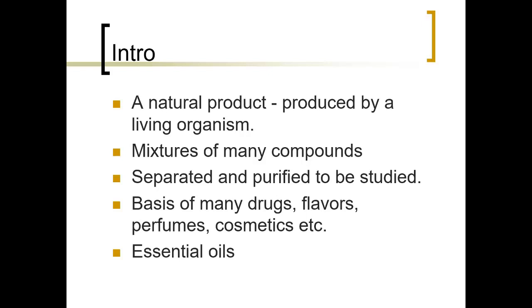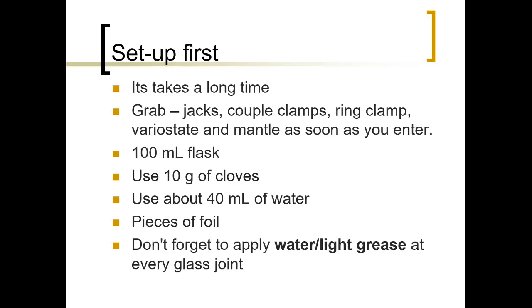In this lab specifically, a little bit different than the extraction of nutmeg, we're going to get an oil, which we call an essential oil. It's the major component of the liquid that comes out of these materials that gives them mostly their flavor and smell, and essential oils are often used for a variety of medicinal chemistry purposes. And this is true for our lab.